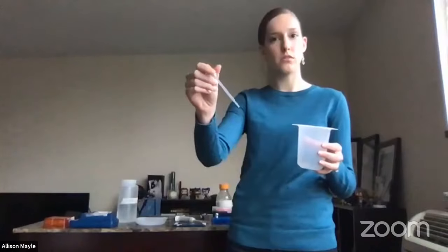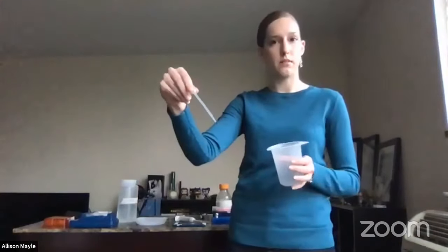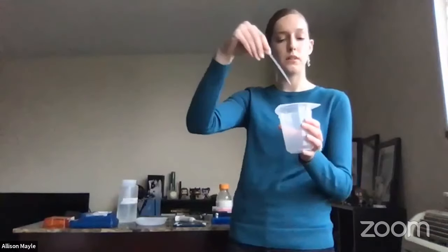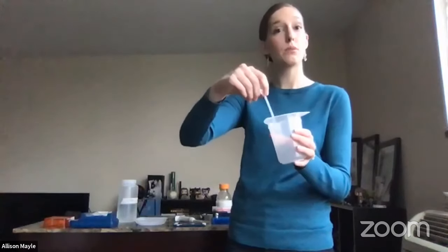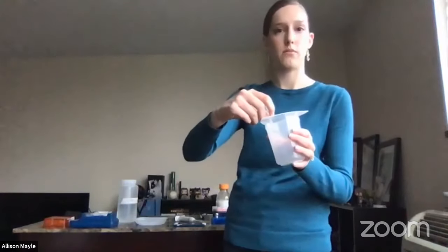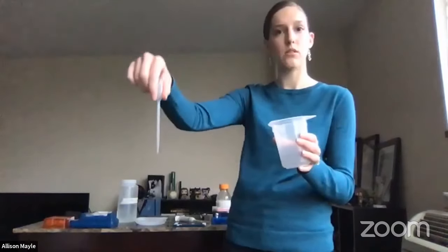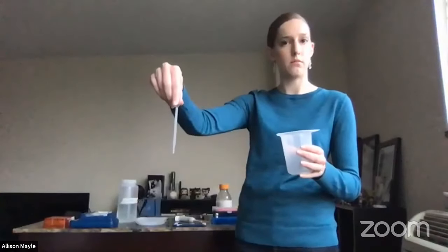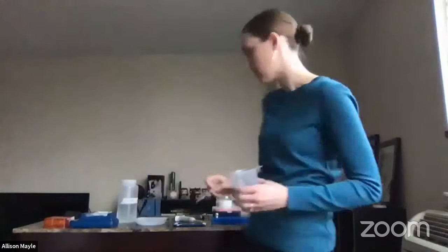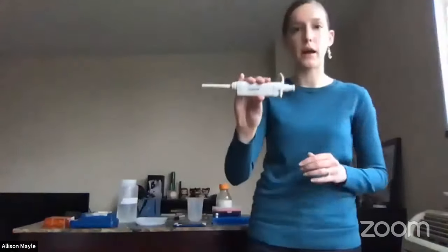So what I would do first is squeeze the bulb, and that lets the air out of the pipette. And then I would put the end of the pipette into the liquid and release the bulb. And that lets the liquid replace the air that I've squeezed out. Right? And then I wouldn't squeeze it yet, I would just remove it from the beaker. And if I wanted to dump it here on my floor, I would squeeze the bulb again. All right, so that seems a little bit silly, but like I said, that's exactly how the micropipette works.